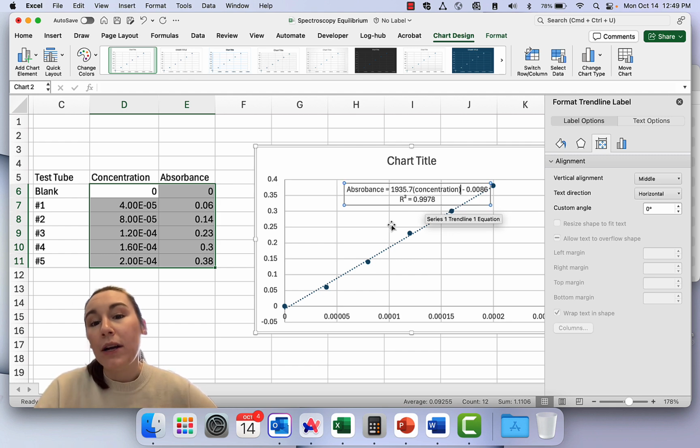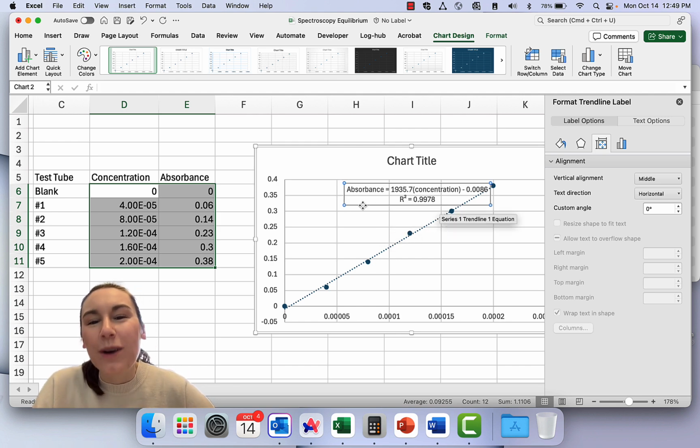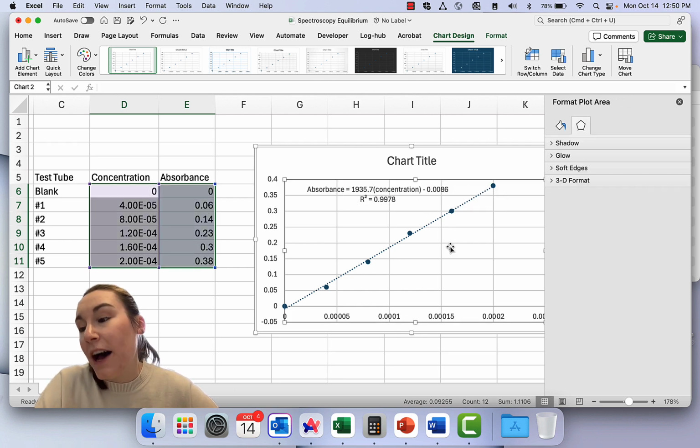In part 2, we are going to make new solutions doing the same reaction. And what we're going to do is take those solutions and find their absorbance in our colorimeters again. So we'll do a dilution to get the solutions made. We'll then use their absorbances in order to find the equilibrium concentration. So this concentration, referenced as your X value, is going to be the equilibrium concentration of the iron thiocyanate.